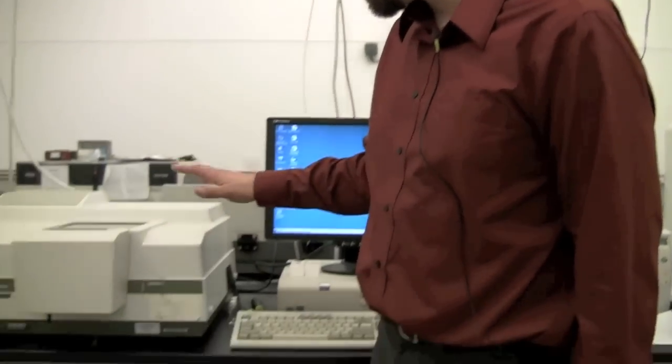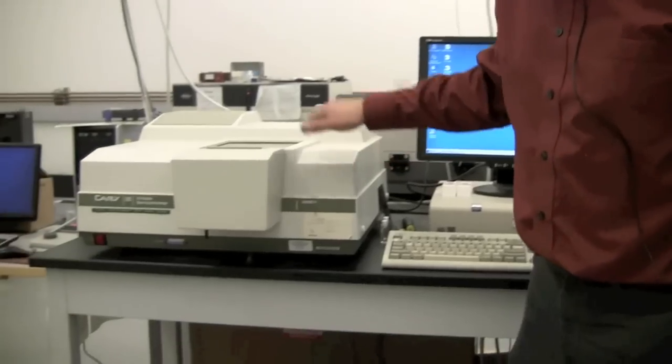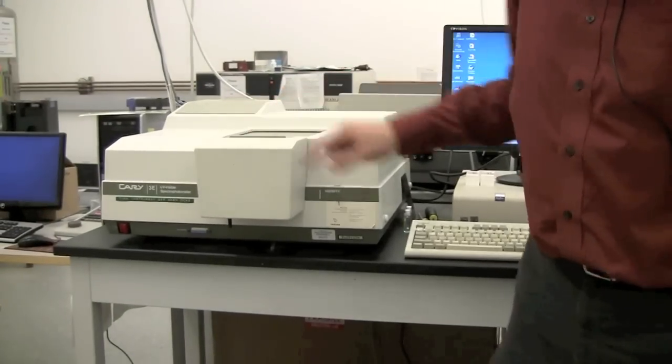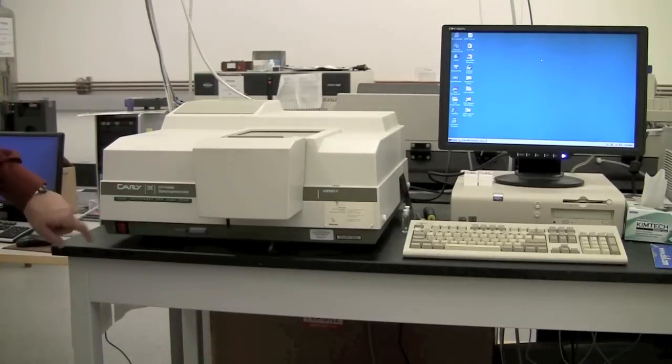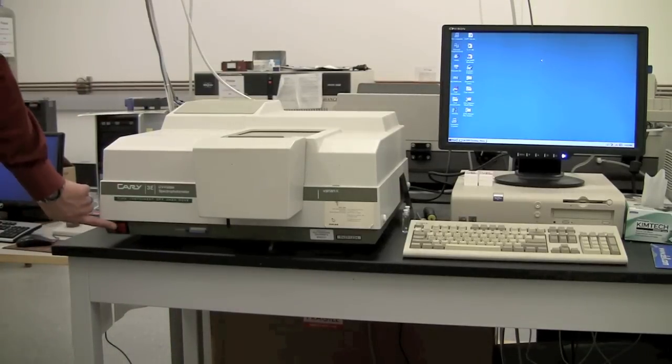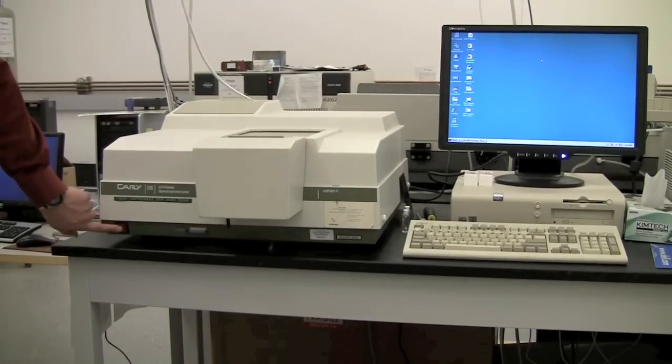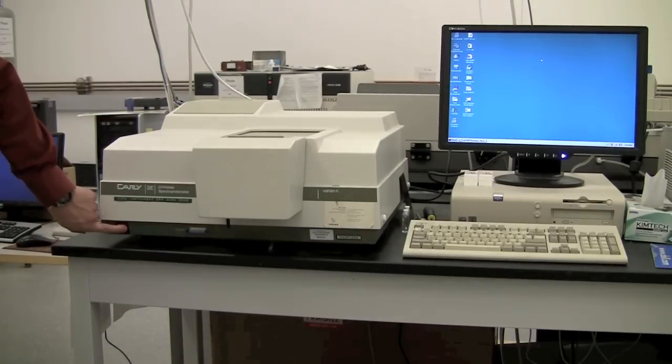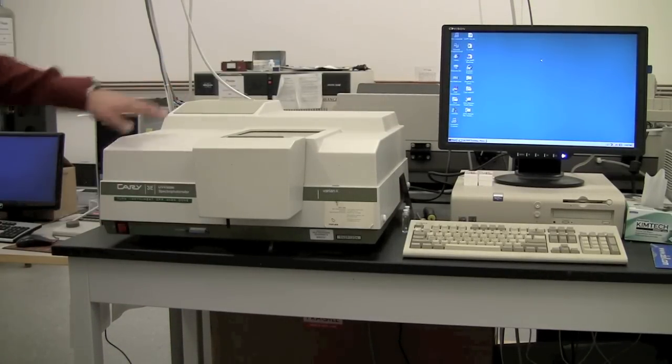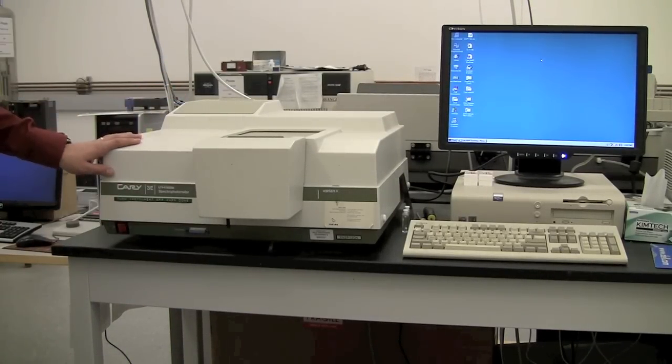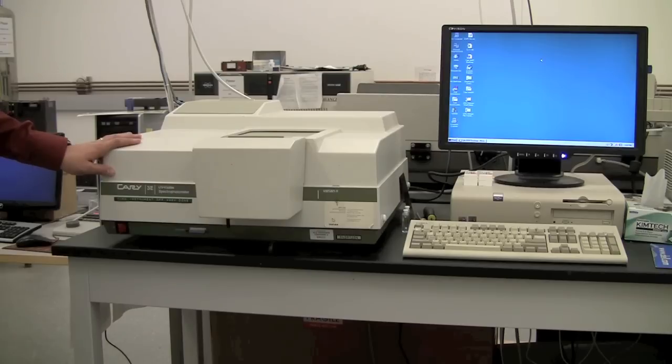This is an explanation of how to use the Carey UV-Vis spectrophotometer. When you come to use it, it should be turned off. The first thing you want to do is use this red button and turn it on. You may hear it click and make some noises as it starts up. That's normal.